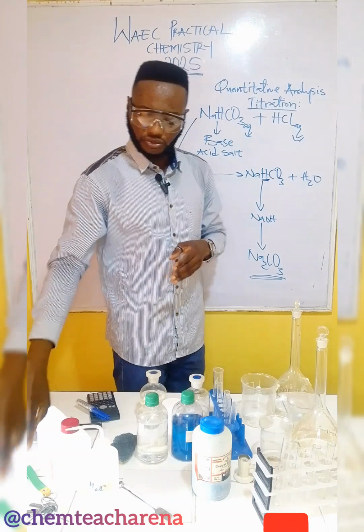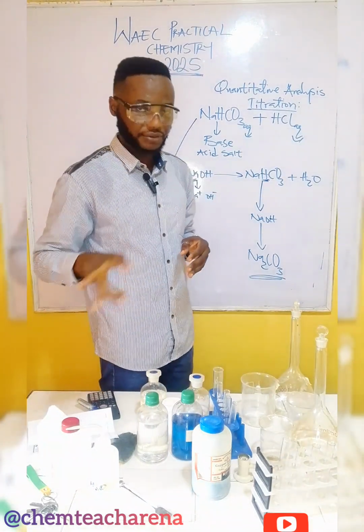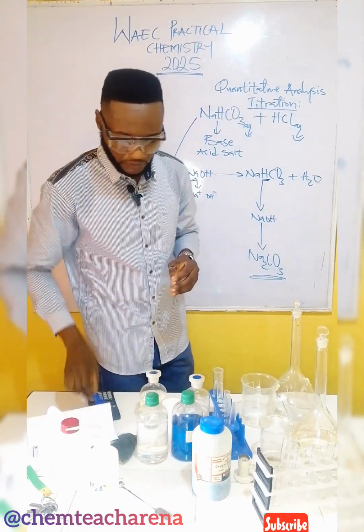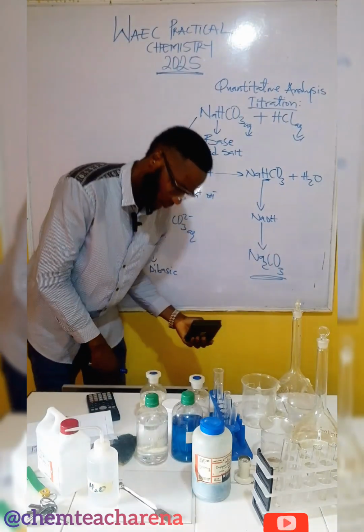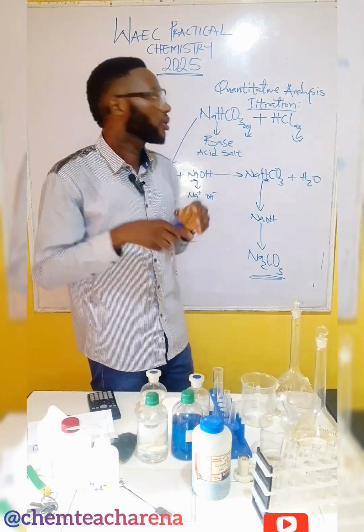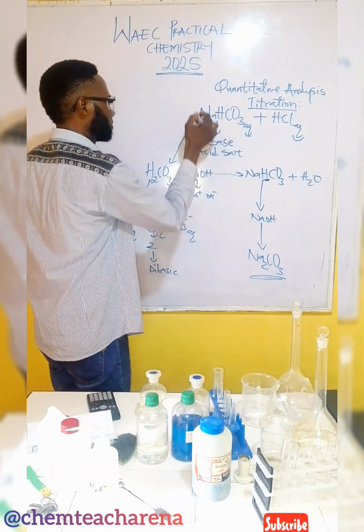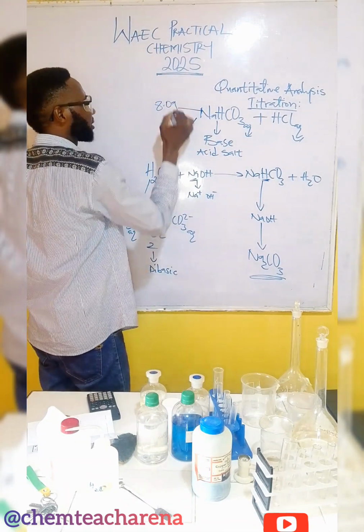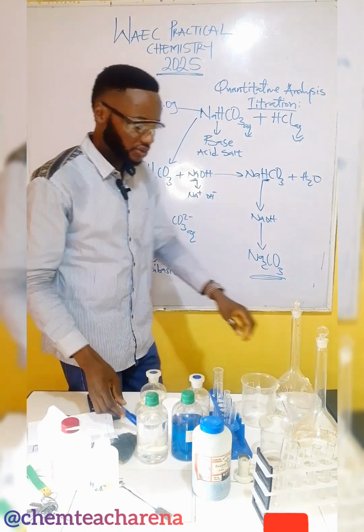Now, according to this guide we have here, it says that we should measure, I hope you can see what I'm doing here, we should measure 8.0 gram of this.